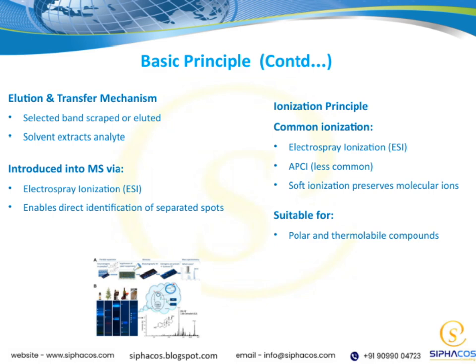So, in summary, the ionization process, particularly ESI, is central to many analytical workflows because it maintains the molecular integrity of polar and thermolabile compounds, allowing for accurate, direct identification in mass spectrometry.